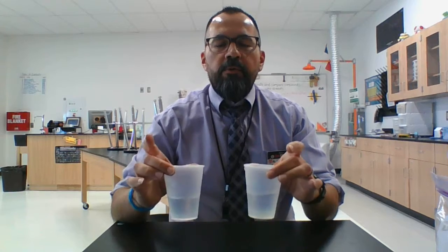So maybe physical properties aren't going to be too useful for comparing two liquids that look so similar. We may use what would be a chemical property. So in class, in order to see if we could differentiate between these two liquids, we tested reactivity. Do either of these liquids react to another substance? So that is what we're going to test.